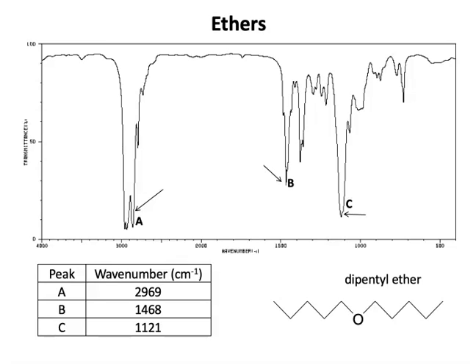It's also important to recognize when you don't get a very exciting IR spectrum. An ether gives you a very unsatisfying look. You'll notice that there is no longer a peak at 1700 because we no longer have a carbonyl. We've got some peaks in the CH bend area, but they're boring. There's nothing too exciting going on there. There's no big giant mound out here. There are no peaks in this normally very quiet area.